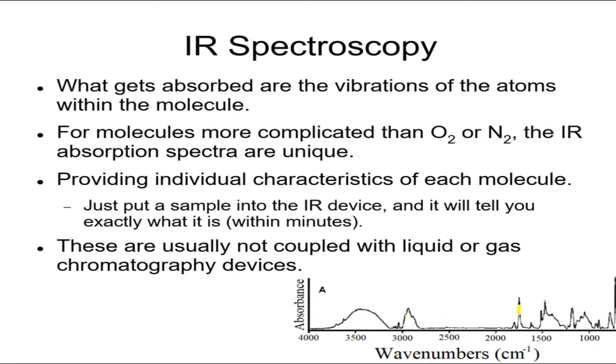So it absorbs a lot over here, a little bit over here, a lot over here, and not much over here. Here I recognize this is a stretching of the CO band, but never mind all that. And again, a whole bunch of stuff over here, all different. This, by the way, is called the fingerprint region. It's called the fingerprint region because every different compound has a different number of these peaks in different places.